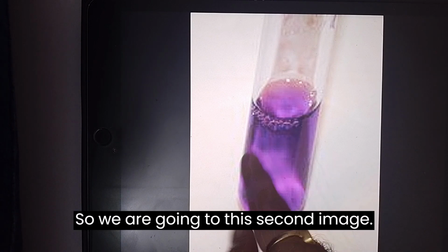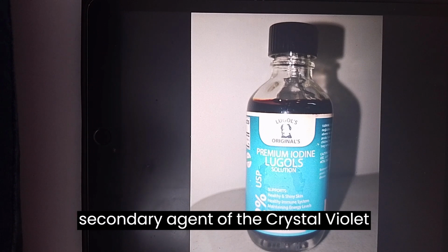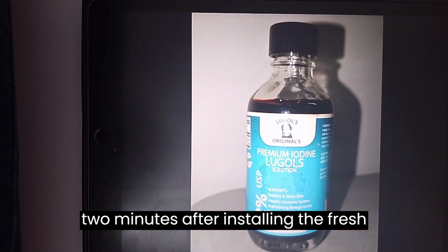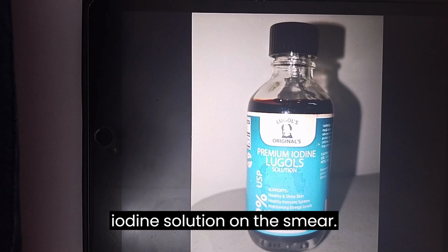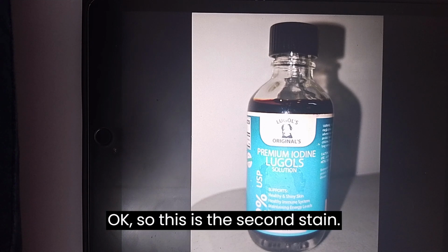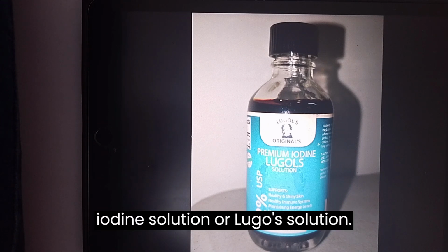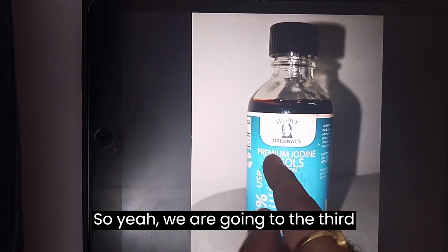So we are going to the second image. This is the iodine stain used as a second reagent after crystal violet stain, and we have to keep the slide for 2 minutes after applying the fresh iodine solution on the smear. So this is the second stain. You can also call it Lugol's iodine solution or Lugol's solution. So we are going to the third image.